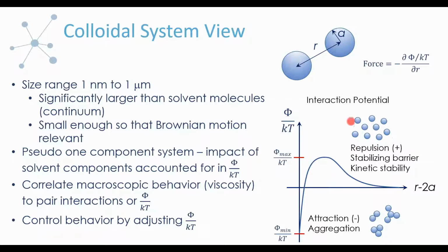In this case, you generally have individually spaced particles or proteins that don't form aggregates because there's this barrier to the attraction. However, if your barrier is minimal and you are able to actually enter into this attractive well, then you do start to form aggregates to some extent. The exact structure that you'll get will depend on the strength of the attraction and the magnitude of the repulsive barrier. Again, the higher the barrier, the more stable your system is, and the less likely you are to form aggregates, even if the potential minimum does exist.